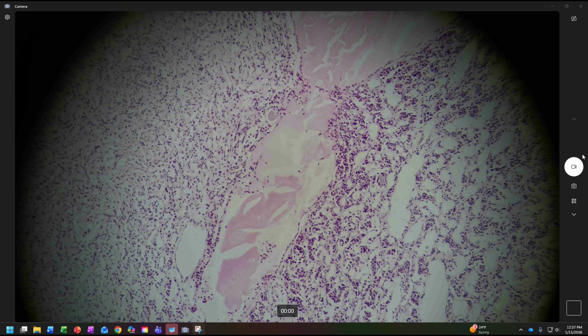Okay, so this is anterior pituitary, this is posterior pituitary. Now, I just want to make sure we don't fall into this trap. So far, anterior pituitary has been on the right, posterior pituitary has been on the left. I hope you're not saying, oh, I just need to remember anterior is on the right, posterior is on the left.